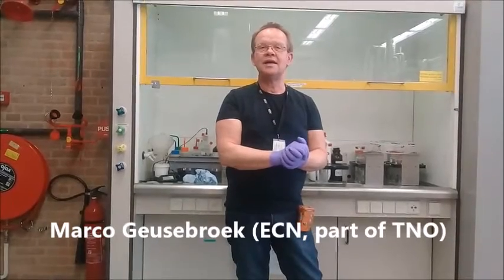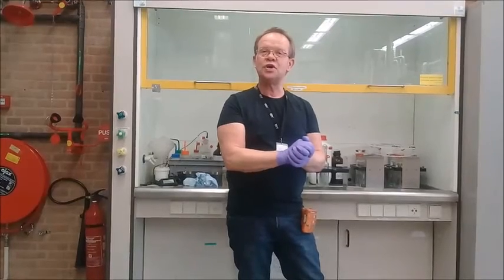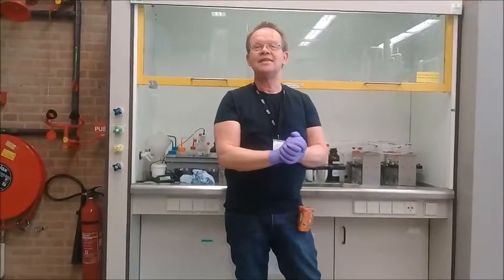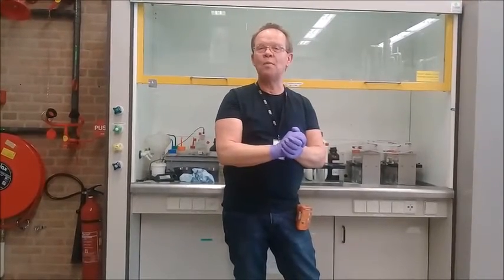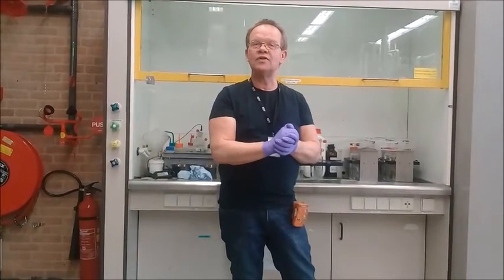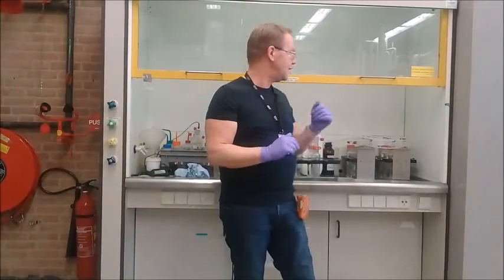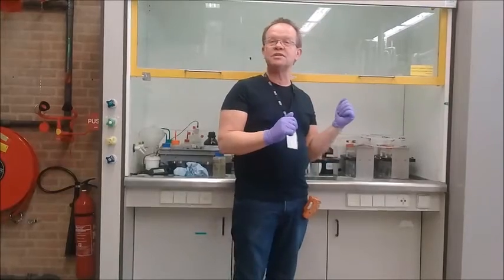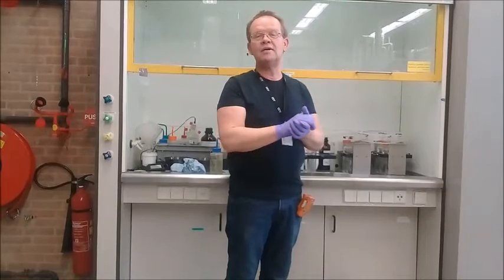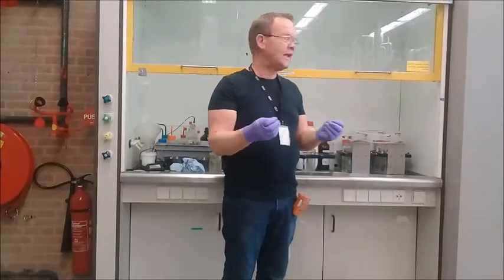I'm a chemical analyst here at the ECN department for biomass research, and we now want to tell you something about the guideline sampling. So that is the sampling in isopropanol in order to measure hydrocarbons and also compounds like sulfur and nitrogen containing molecules. For that purpose we prepared 2 racks of 6 washing bottles. They will be placed subsequently in a warm bath and in a cold bath with glycol at -20 degrees in order to freeze out all the aerosols.